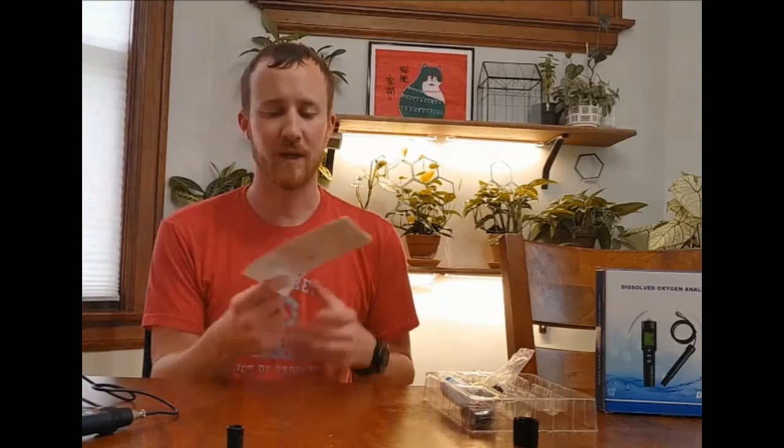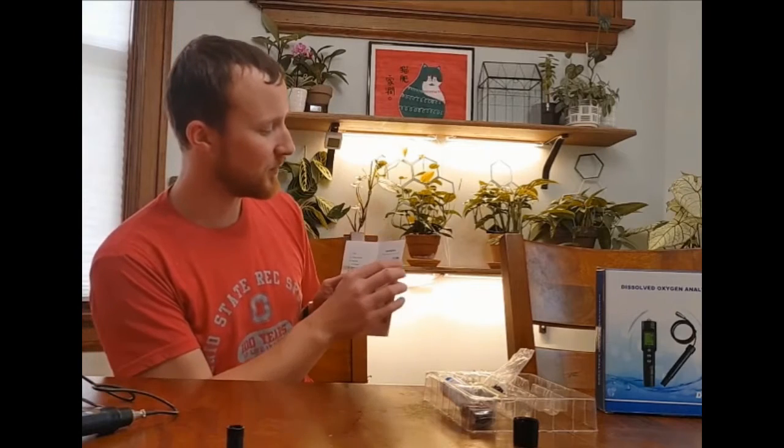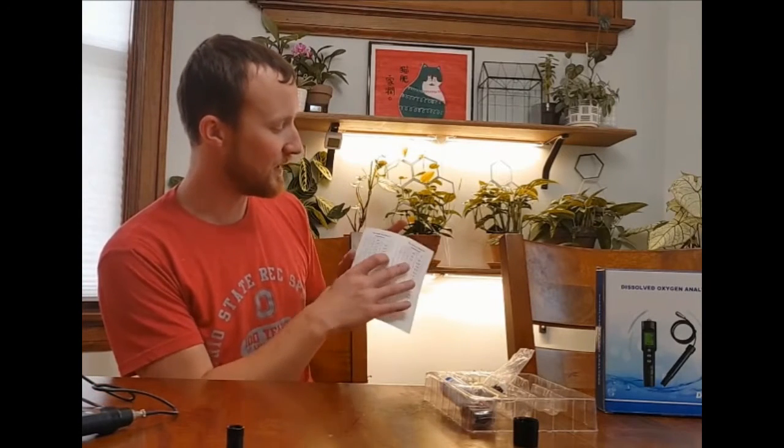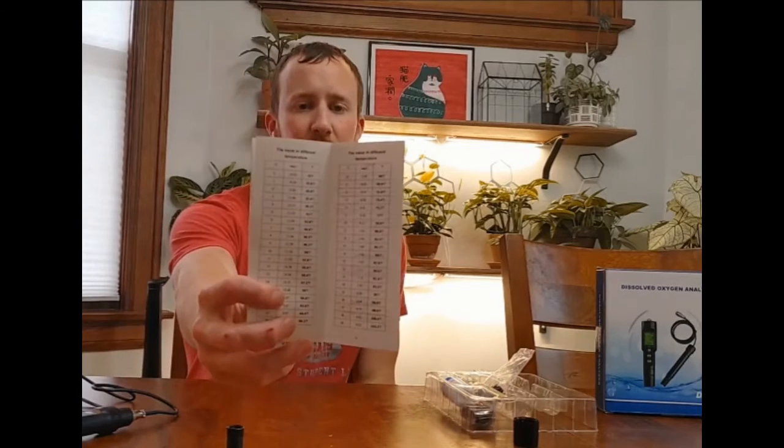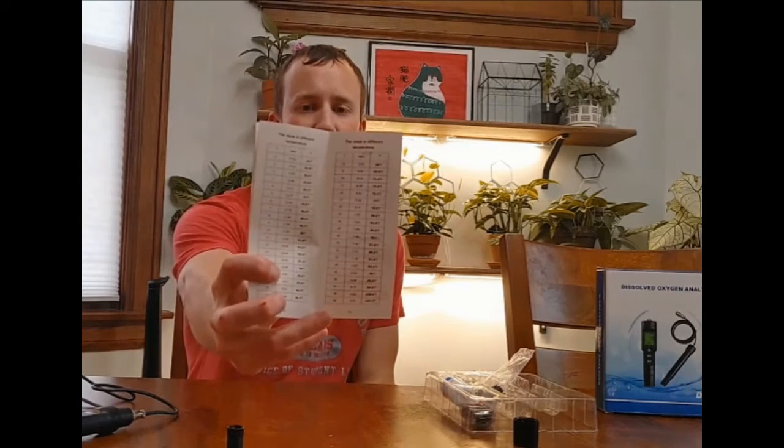It comes with an instruction manual, and in the back of the instruction manual there's a temperature chart for you to adjust the dissolved oxygen to the temperature of the liquid you're measuring.